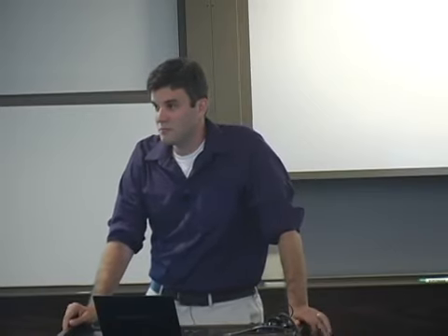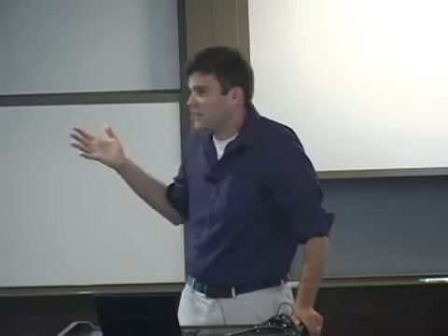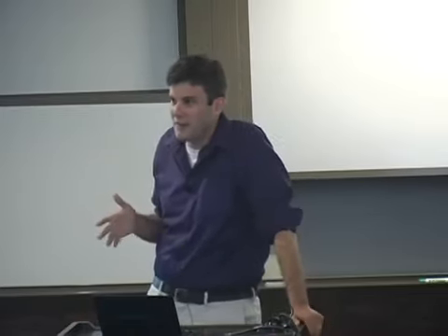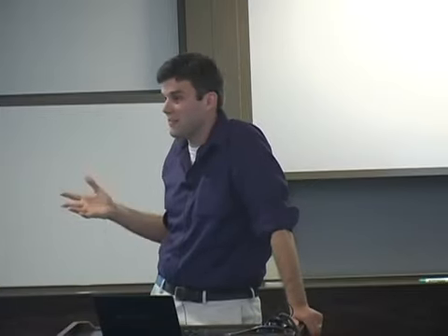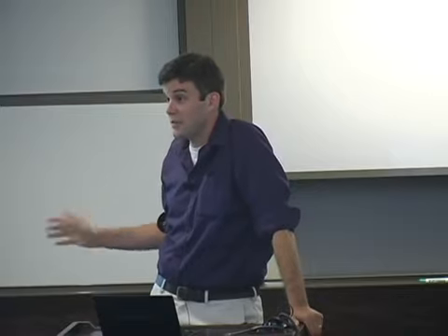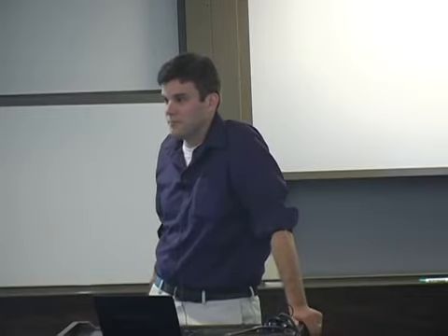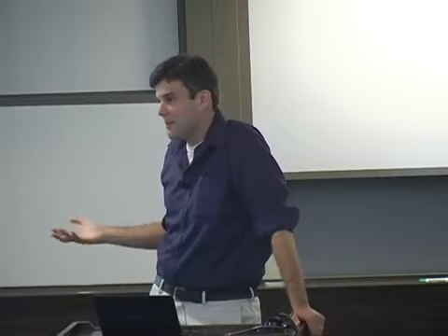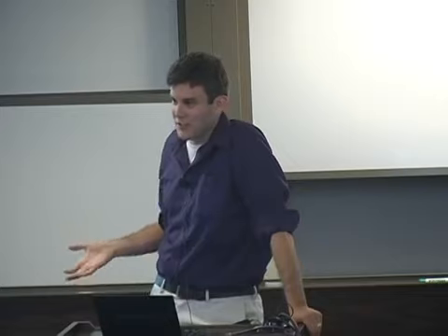With the units, was that kind of just ad hoc how you handle those, or did you apply some strategy? These are well-known units in NMR, and to make that unit conversion object, you have to pass it the dictionary of spectral parameters, and it reads from those and generates them, basically. So it's like when you read in a file, you get those. Yeah, you get those, and I could probably make some different object that automatically generated them as soon as you read, but not all the file formats can actually give you, for sure, good units.